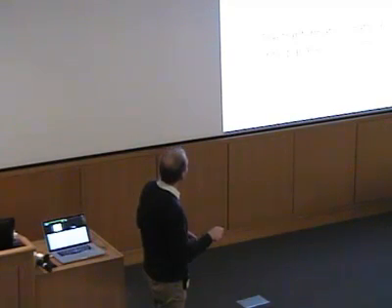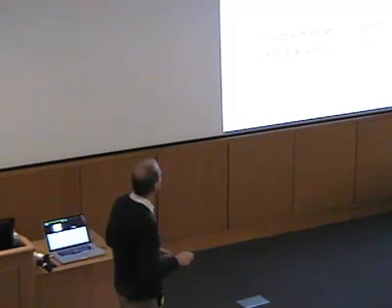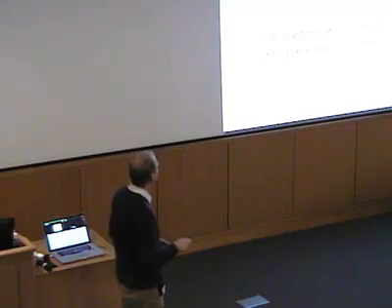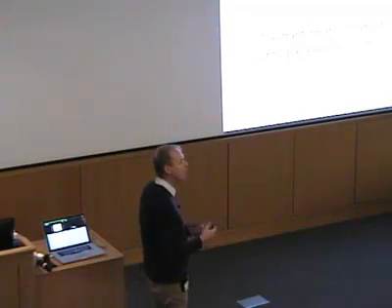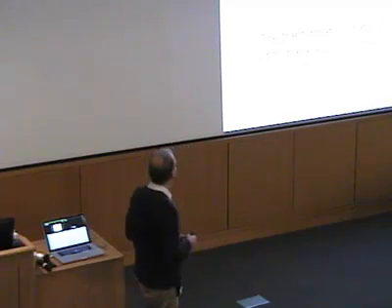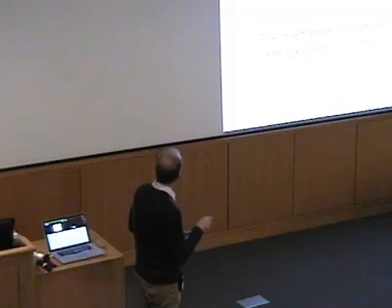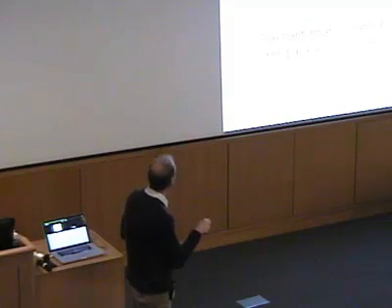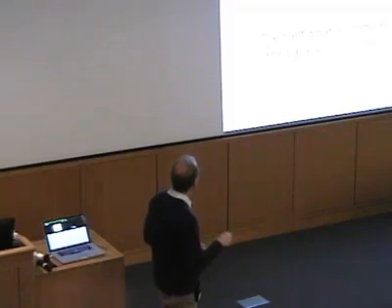When I've done that, these 3 values that I wind up with are known as the principal g values of the system. And these are not dependent on the orientation essentially anymore. These are properties of the molecule itself. Right? So the values here depend on the definitions of the axes A, B, and C, and so on. I could choose a different set of axes A, B, and C, and I would get a different matrix here.